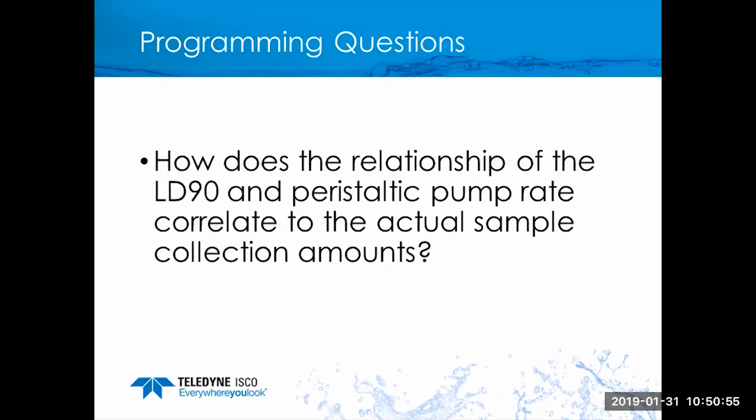Now, if the question means that I go out and I deploy the unit and I had a program put in and I take it back to the office and set it on the shelf for a few days and take it back out, and when I've powered it back up at the next deployment, my observations are that everything in the program is reverted back to some default setting, not what I entered in the last time. That could be an indication that the internal lithium battery has gone bad in that unit and it's unable to maintain and save and preserve those program settings when external power is disconnected.